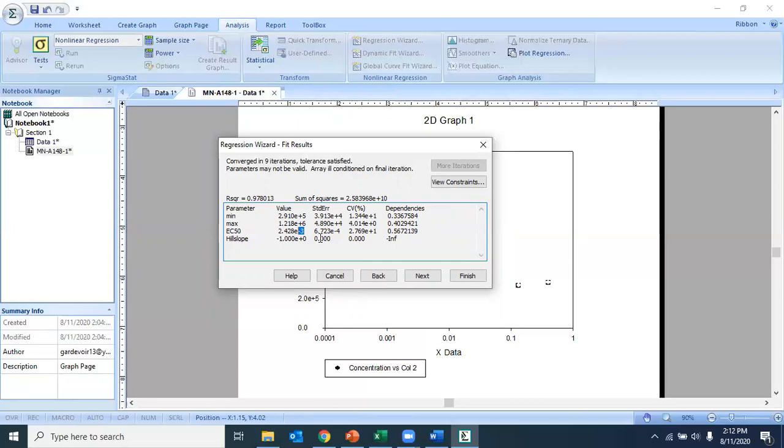So you always have to remember that and make sure to make that conversion, because 2.428 micromolar is really good. 2.428 times e to the -3 micromolar is way different, right? We don't want to report something that's wrong. So just make a note of that, because you always do want to report these in terms of micromolar.